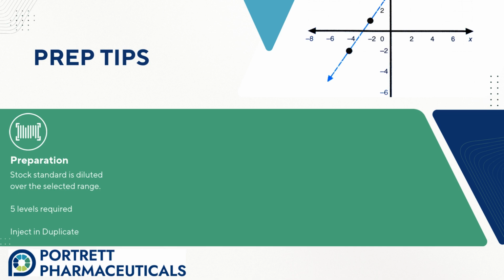In the case that I have shown here, quantities are limited, but solubility is not. The linearity stock solution is prepared at 1 mg per mL, and 20 mL is prepared. We like to confirm through an Excel calculation that our proposed concentrations are correct. So our second column is our target concentration, and the last column is the actual concentration using the dilution scheme specified in the third and fourth columns.